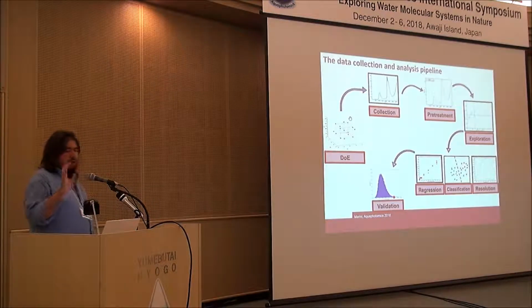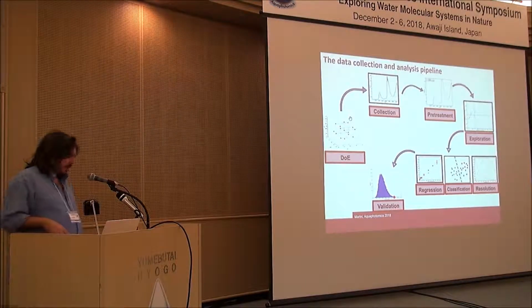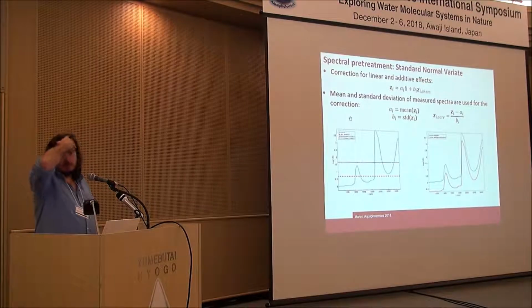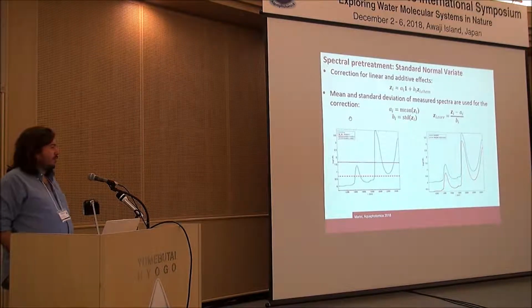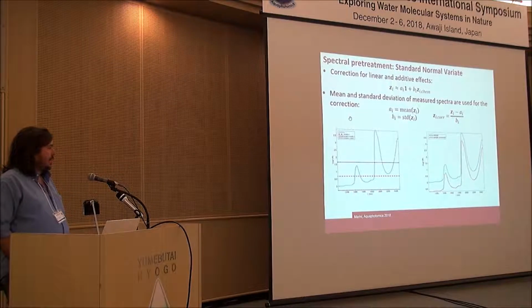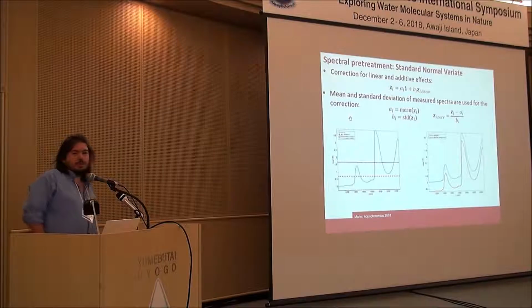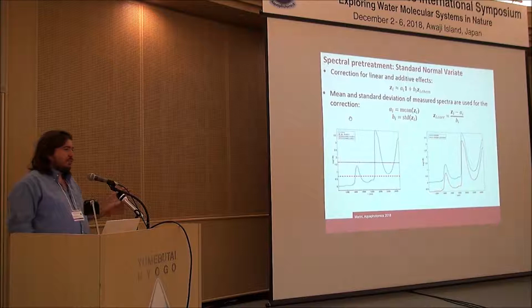And I will try to briefly cover some of these aspects, also considering the time constraint that we have within this workshop. Of course, spectral pretreatment. We have already listened to a very thorough first workshop about the ways of removing or controlling spectral variability. And so here I actually just left a couple of slides about some methods that we normally use, especially within the framework of infrared spectroscopy, to try to remove specific sources of variation.